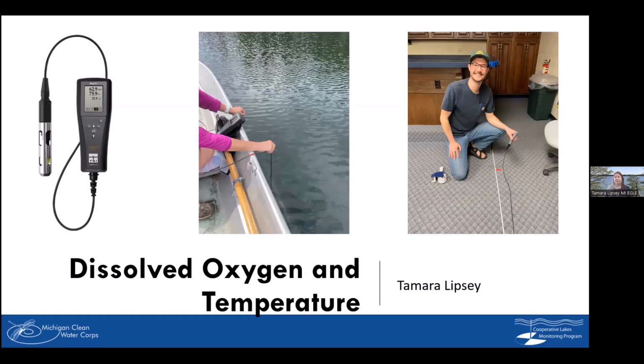My name is Tamara Lipsey, and Eric and I have been hard at work getting the dissolved oxygen and temperature meters ready for everyone to use. On the left is one of our types of meters. In the middle is someone taking dissolved oxygen and temperature readings. And on the right is Eric helping me measure out the cables and the depths for you all.